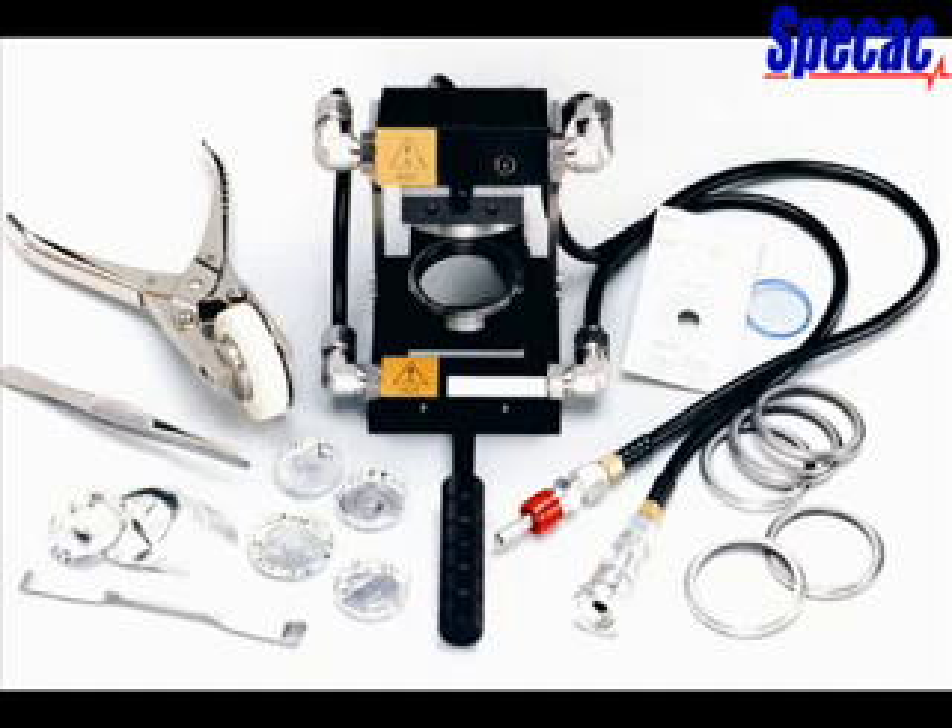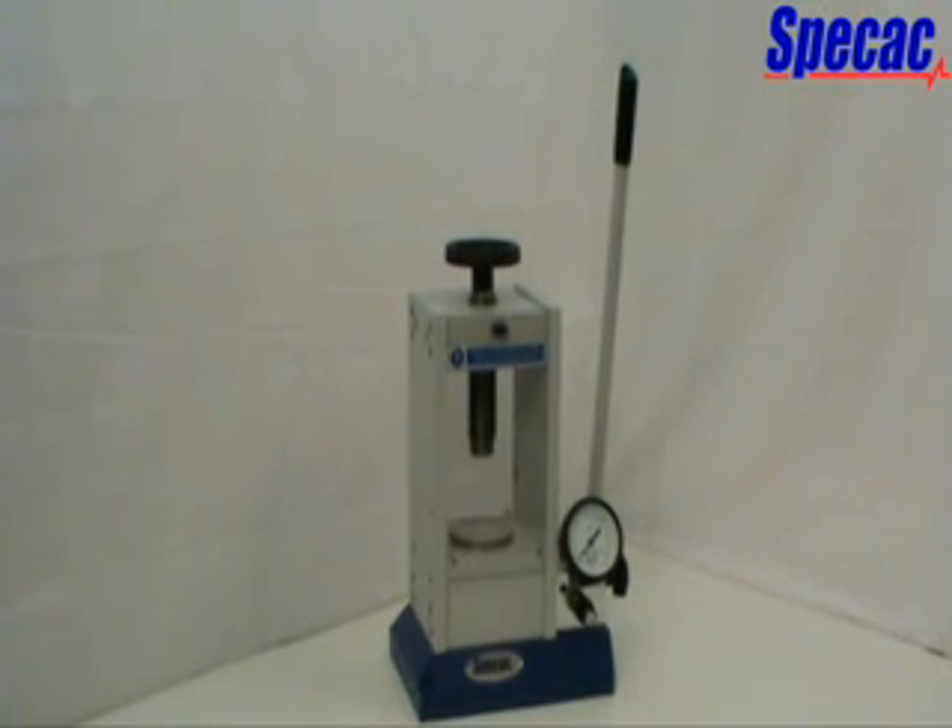The Atlas High Temperature Constant Thickness Filmmaker Accessory, part number GS15800, can also be used within the 15-tonne manual hydraulic press for the preparation of thin films of samples that have melting points up to 400 degrees centigrade. The high-temperature filmmaker accessory has its own heating platen system, so does not require use of the Atlas heated platens. The SPECAC 15-tonne manual hydraulic press is a versatile, easy-to-use and very robust piece of equipment for a very wide range of pressing applications.